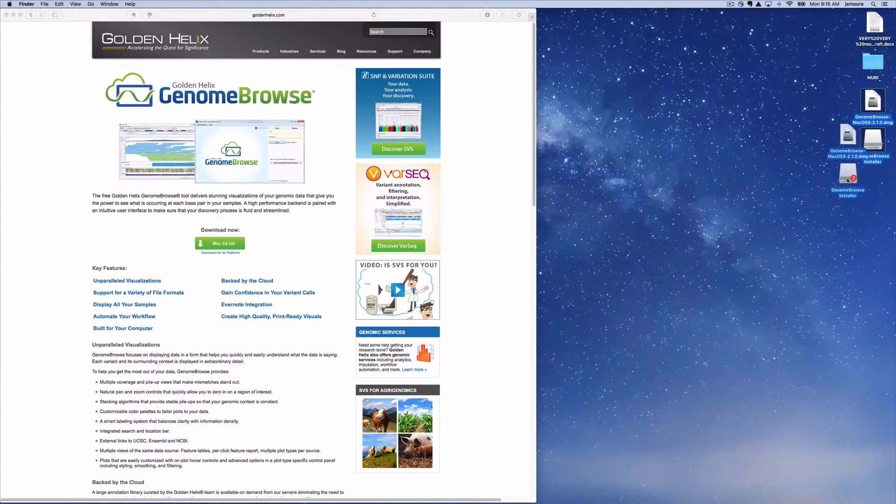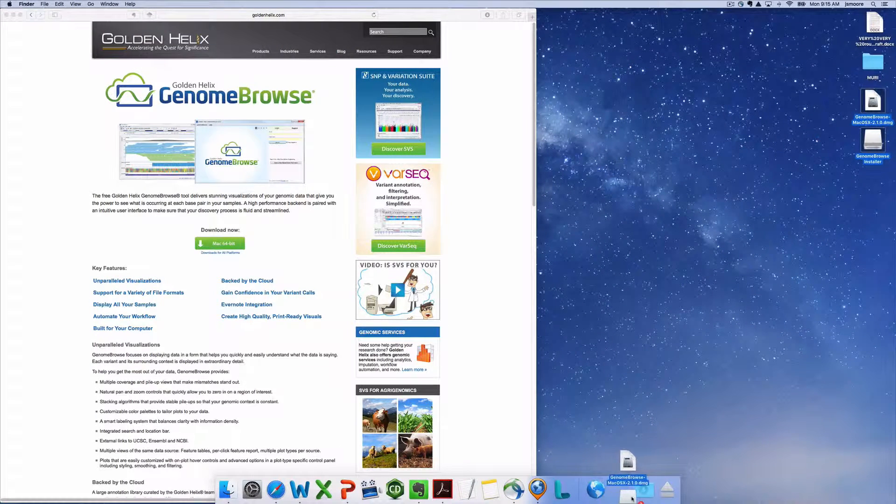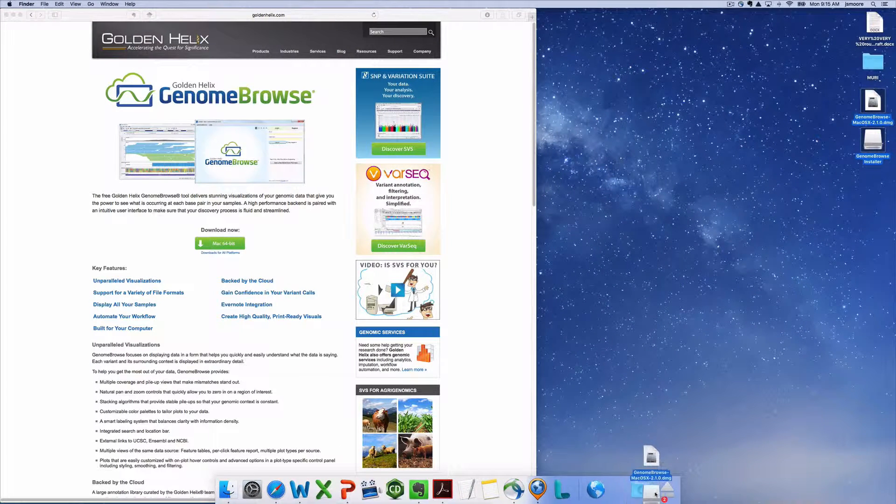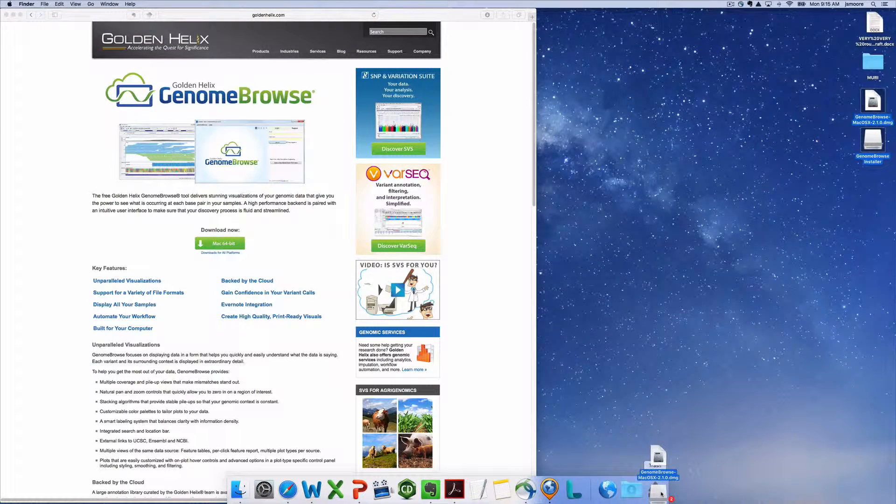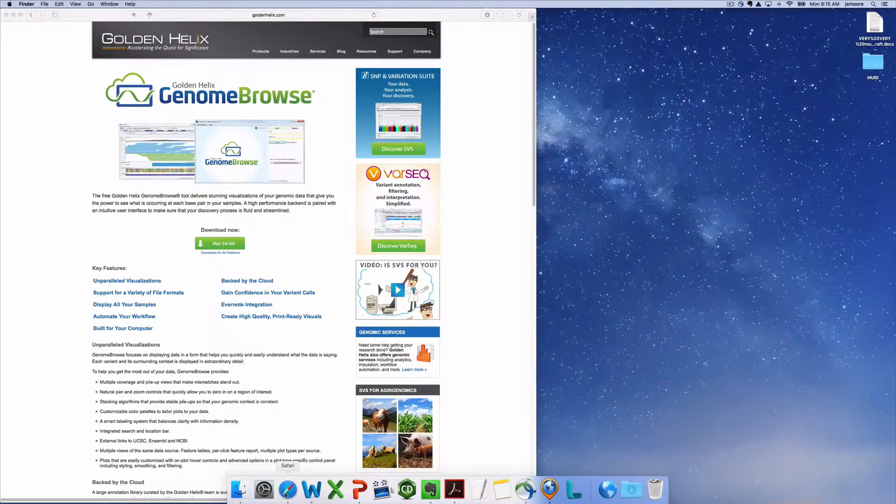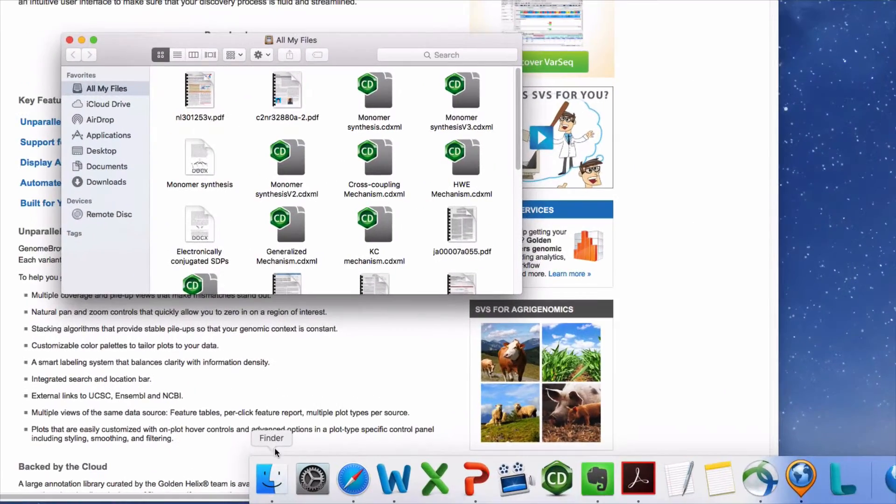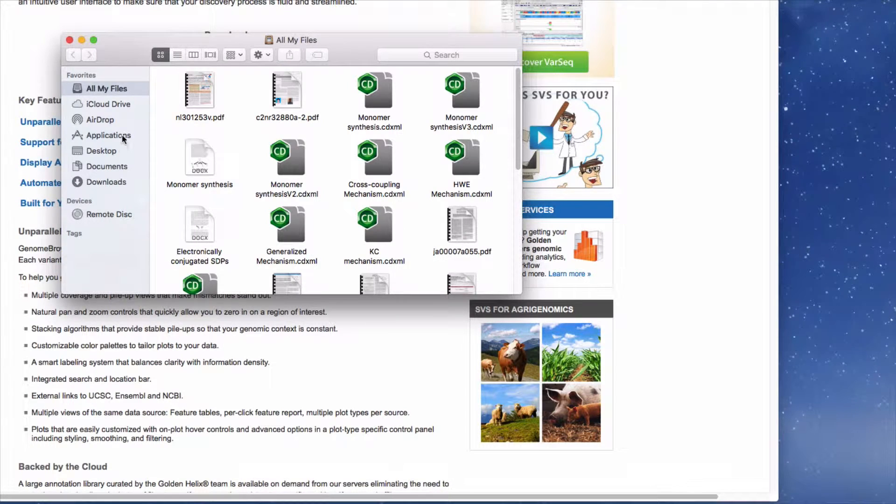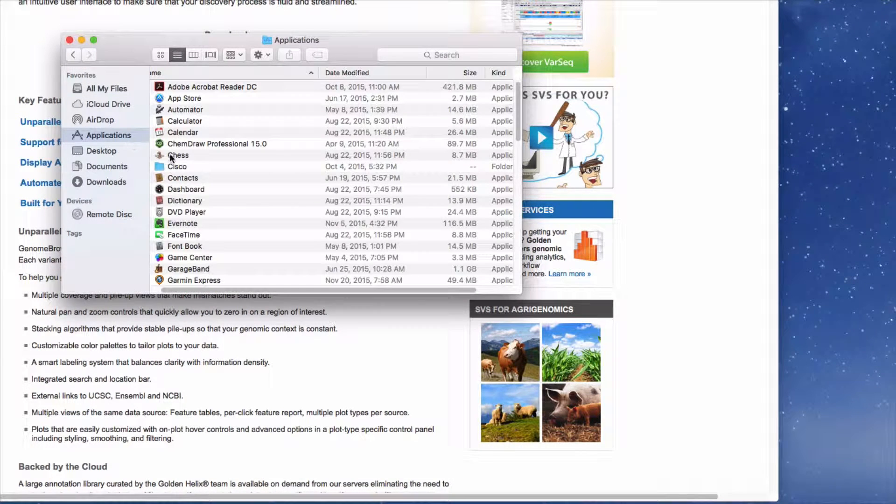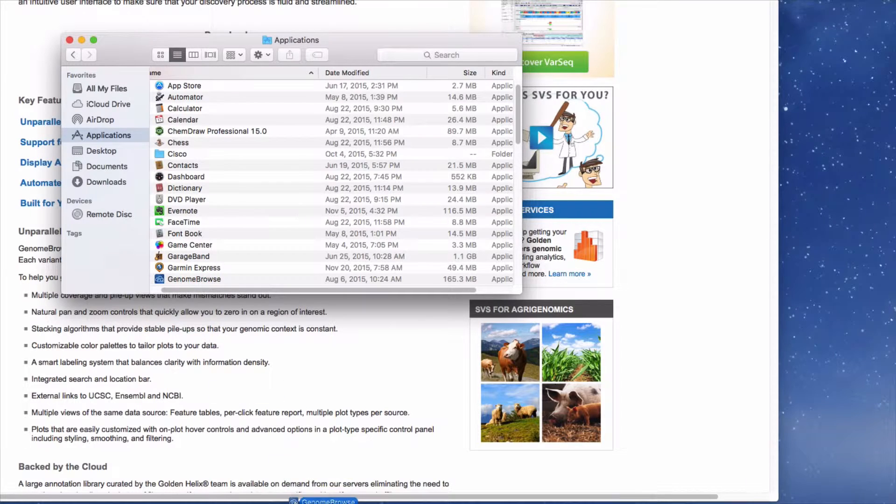Move the DMG and installer files into the trash. Use the Finder to locate the Genome Browse application. Drag the Genome Browse application icon to the dock.